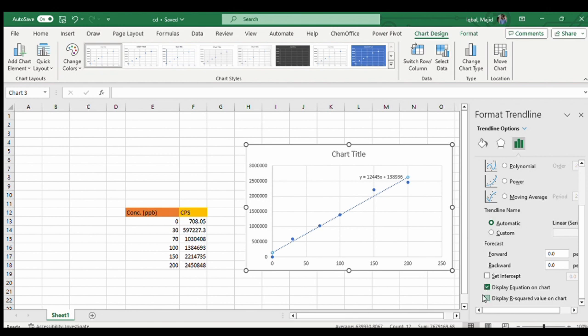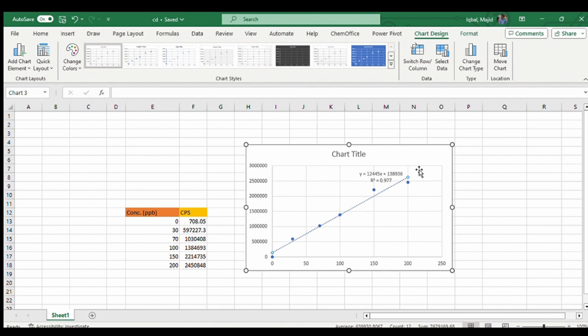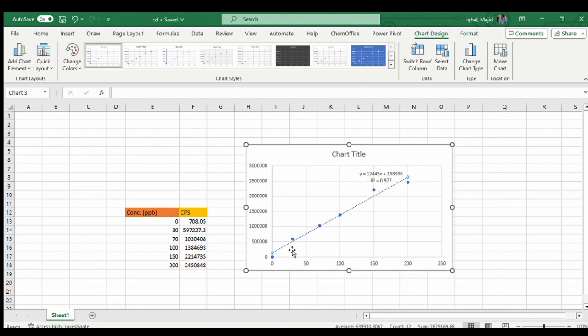You have to select this way. Now you got the equation of the straight line here. From that you can find out the unknown value, unknown concentration using this equation of straight line. This R square value 0.977 is real-time data from ICPMS. This point is slightly deviating from the straight line, so the ideal would be R square equal to 1.